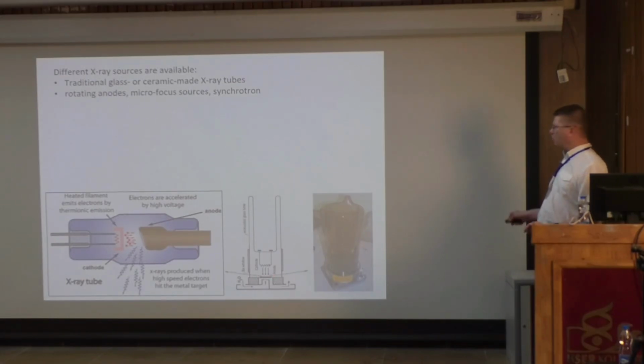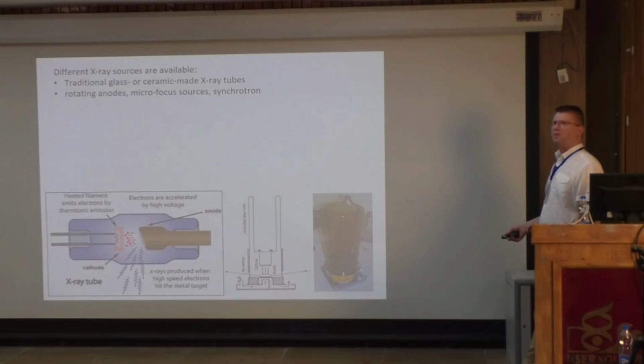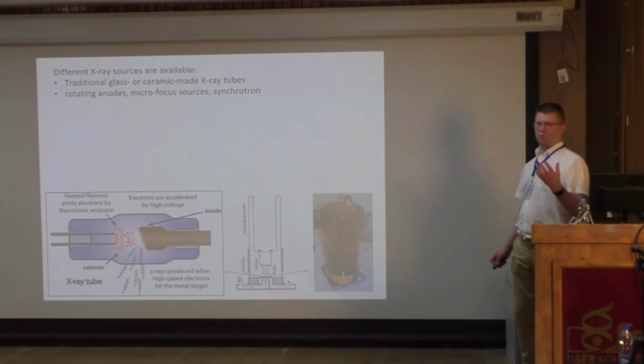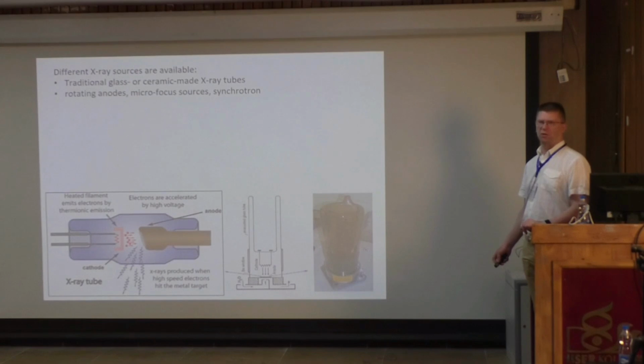And now they have to come out from this glass tube. So how do we do that? The one thing that is done is that we have small windows here. It's difficult to see, but maybe there is a round window in here. And the round window is made from beryllium metal, because beryllium metal doesn't absorb X-rays. So it's like a window, but you cannot use a normal window. So you have to use beryllium for this. It doesn't absorb X-rays at all. But the only difficult thing with beryllium is it's a poisonous metal. So you should not touch this beryllium with your hand. But it's okay.